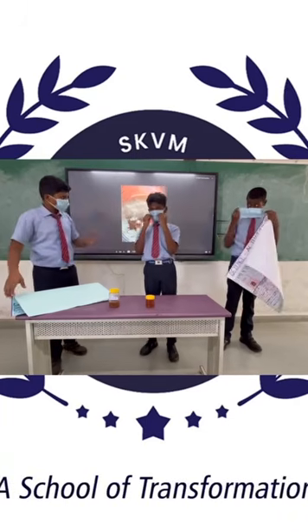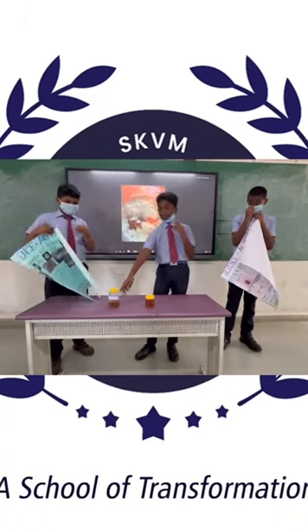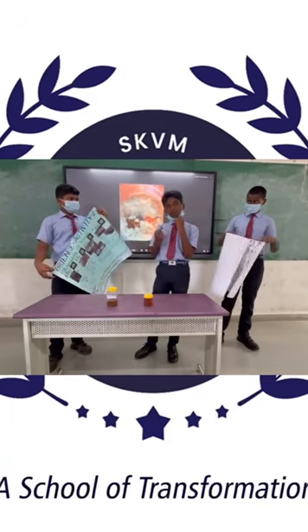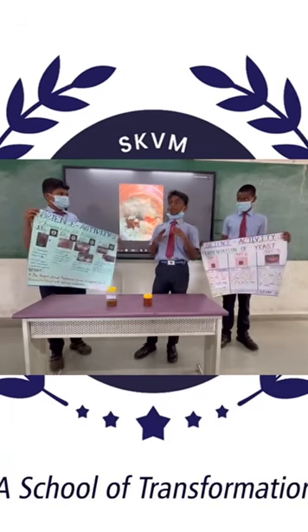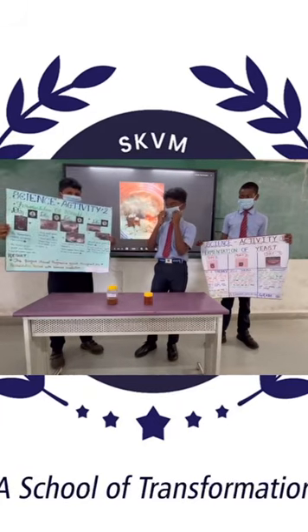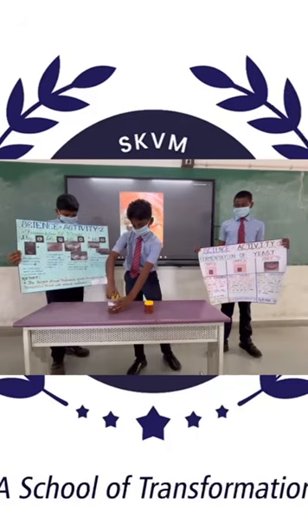We are wearing a mask because the black mold spores evaporate, and if we breathe them in, they will go to the nose and damage the lungs. So that's just for safety. Okay, we will wear the mask. Next I can show that.